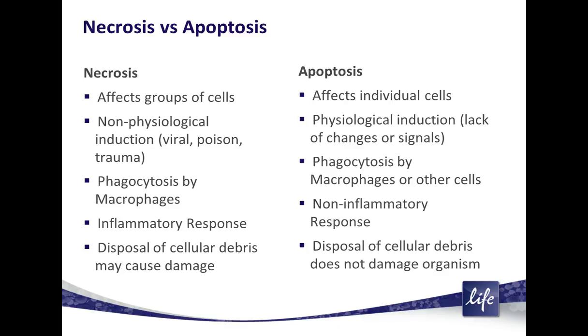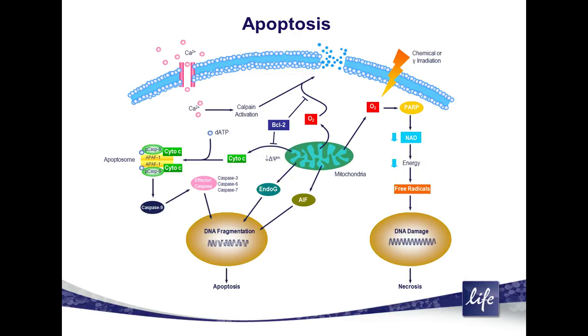This shows an illustration giving a very simplistic overview of apoptosis. Cascade-type pathways are triggered by various insults to the cell. Different triggers proceed through somewhat different combinations and orders of effect, but all involve, at some level, mitochondrial changes, changes in membrane structure, activation of caspases, DNA fragmentation, and ultimately cell death.